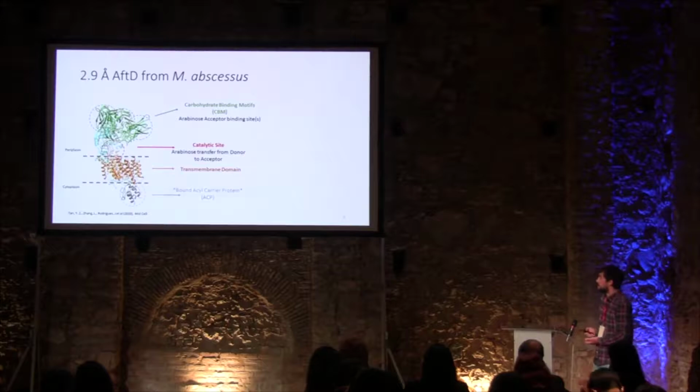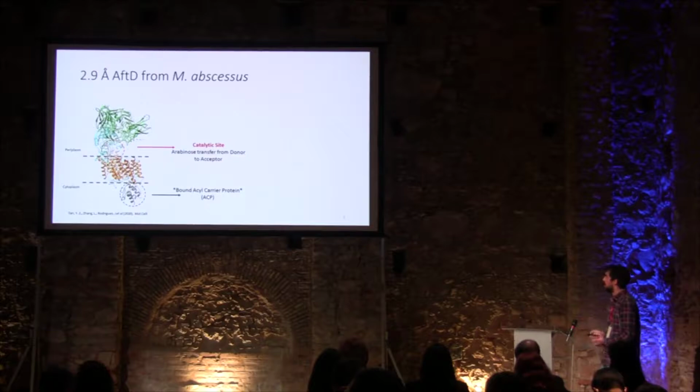And to our surprise, on our structure we had a bound acyl carrier protein from the host organism. In this case it was E. coli ACP, and we were very puzzled about that, and I will talk about it on the next slide.